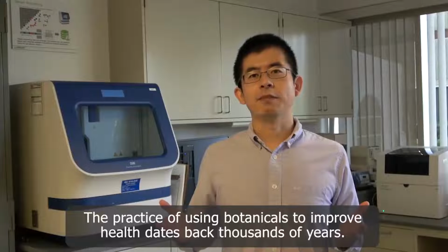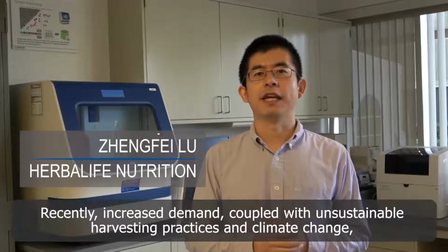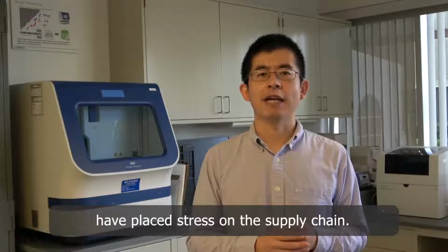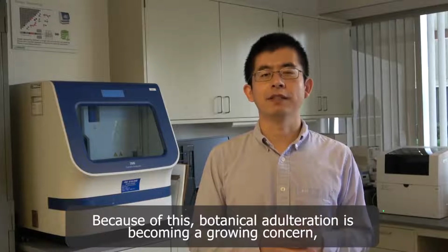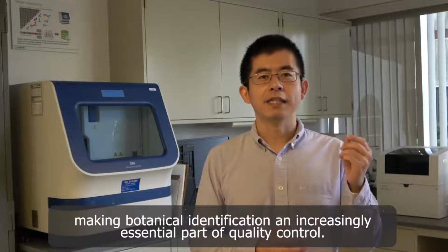The practice of using botanicals to improve health dates back thousands of years. Recently, increased demand, coupled with unsustainable harvesting practices and climate change, have placed stress on the supply chain. Because of this, botanical adulteration is becoming a growing concern, making botanical identification an increasingly essential part of quality control.